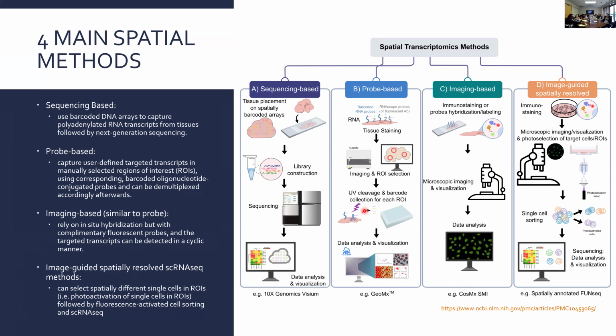The sequencing-based approach is what 10x Visium is. Now the HD is a little different because it uses probes, but it's a similar concept, where, as I was talking about, you have a tissue slide. These little dots are all the individual spots on that slide that have barcodes to ligate to your transcripts from the cells and to be able to resolve where they came from in position. And so you're generating your library, doing your regular sequencing, and the downstream analysis.